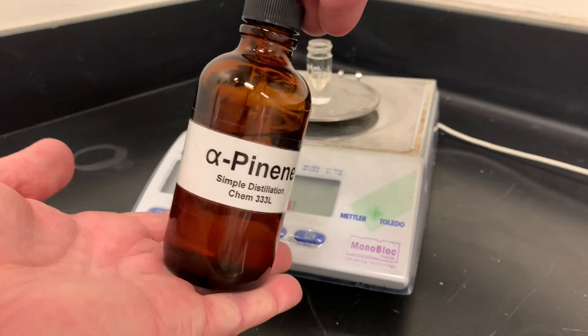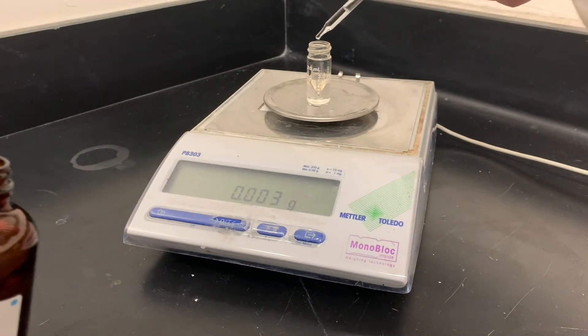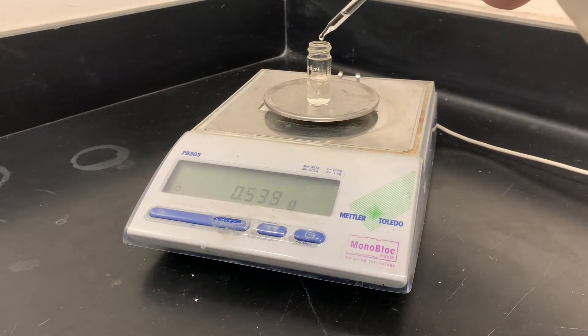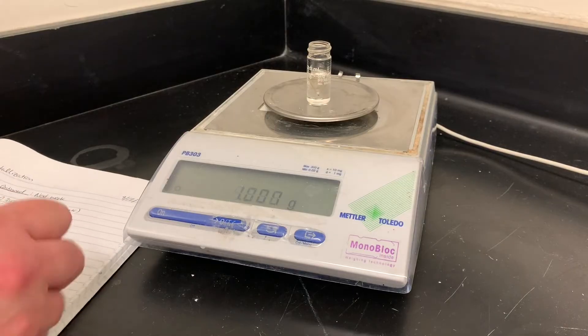Our compound today is alpha-pinene, which is an essential oil. It has a very distinct smell and comes with a dropper, so you can add it directly. Don't forget to zero out your scale before you start. It takes about two droppers full, so once you get to the second one, slow down a bit. Record how much you took.